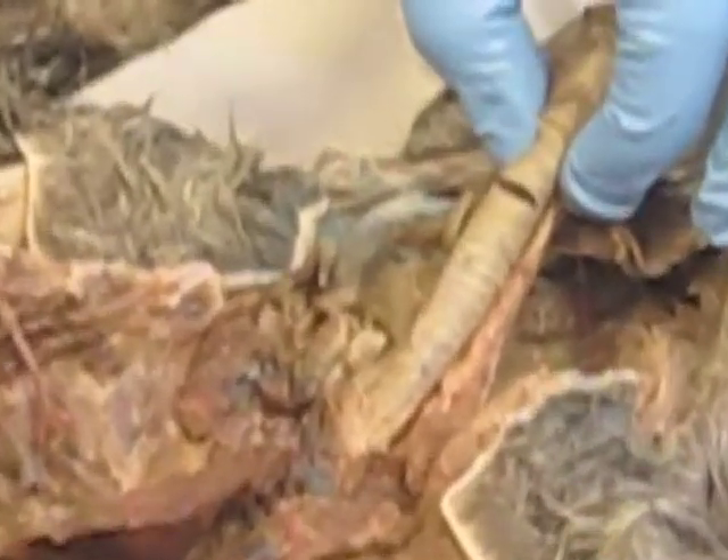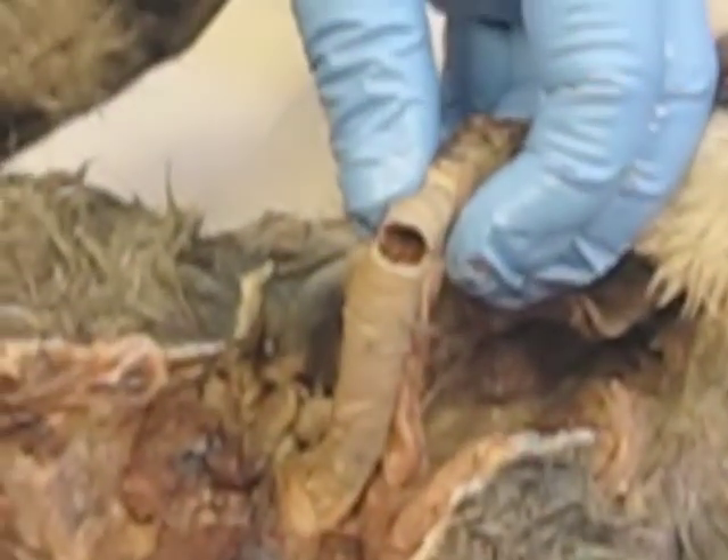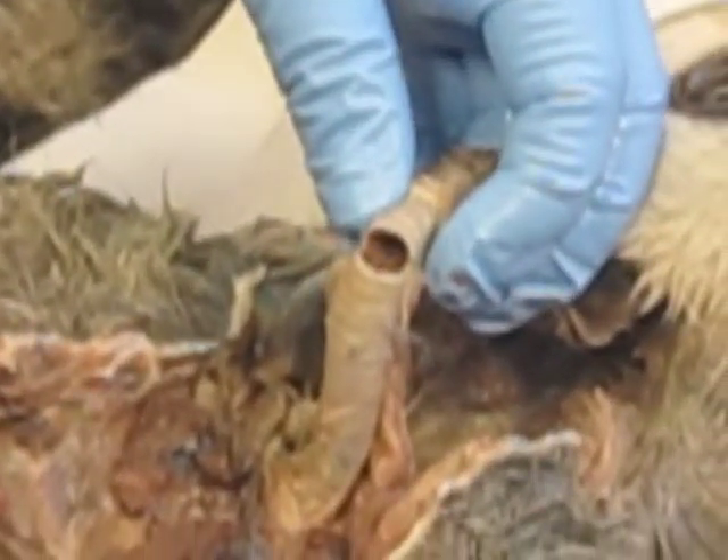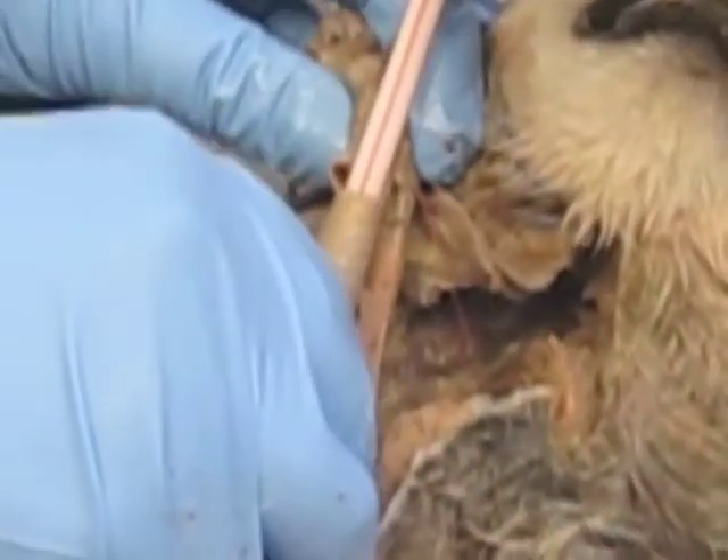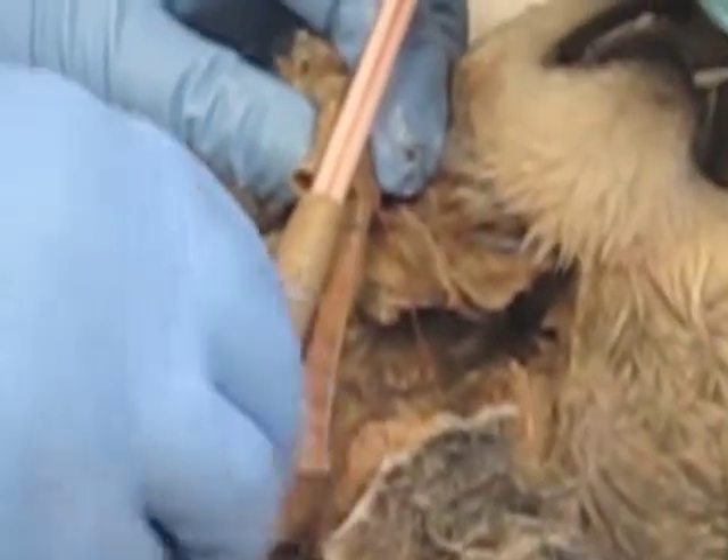Okay, and then — can you do me a huge favor? Go get me a straw. What you're going to do is we're going to get this in here. I want to try after you. And then you want to blow in it? Blow.